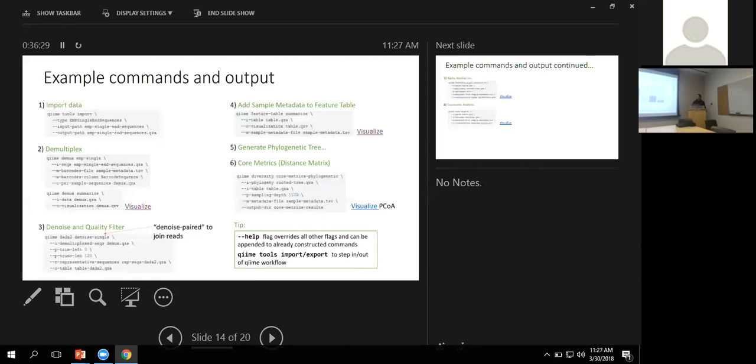So this is an interesting way. I mean, you could do this in other ways, but this is an interesting and convenient tool to see where you're losing samples and to help you decide your cutoff value. Yeah.